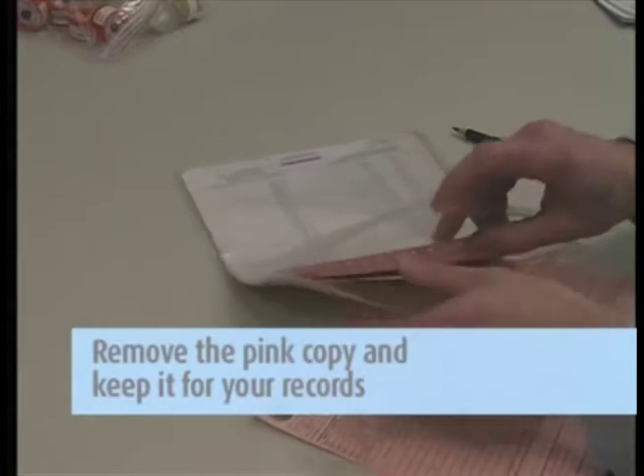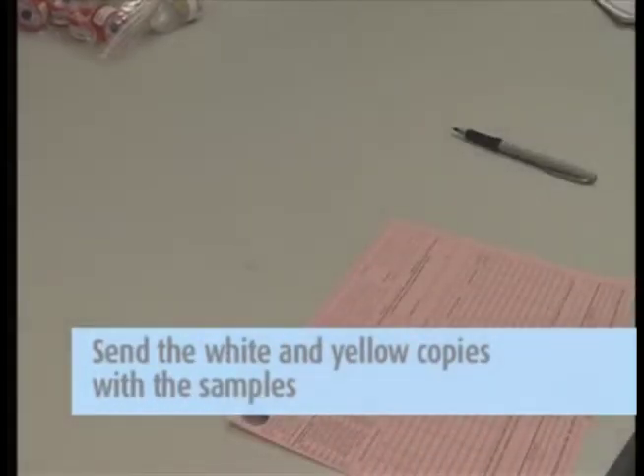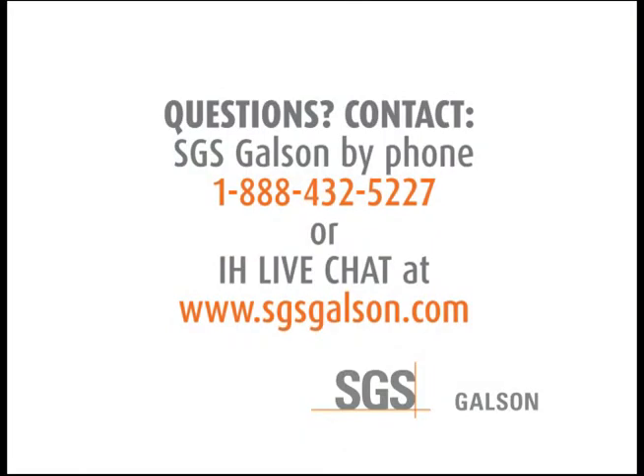It is important that you include all the information requested in order to ensure the turnaround time of your samples. Remove the pink copy and keep this for your records. Send the white and yellow copies in with the samples to the lab in the large Ziploc bag. Questions? Contact SGS Galson by phone or IH Live Chat.